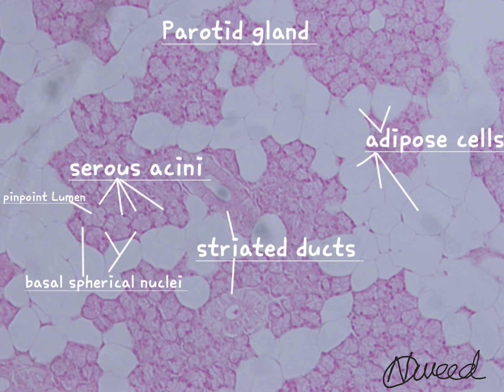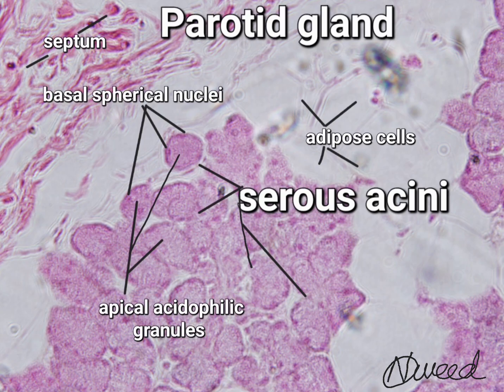The serous cells of the acini are generally pyramidal in shape, with a broad base facing the basal lamina and a relatively narrow apical surface facing the lumen of the acinus. Each cell contains a spherical nucleus located in the basal part of the cell. The apical region of serous cells contains numerous secretory granules called zymogen granules.